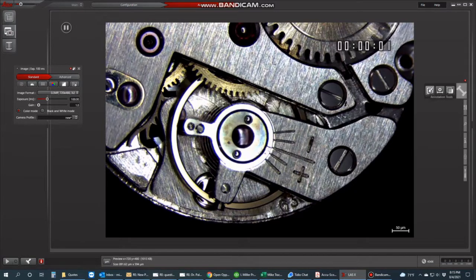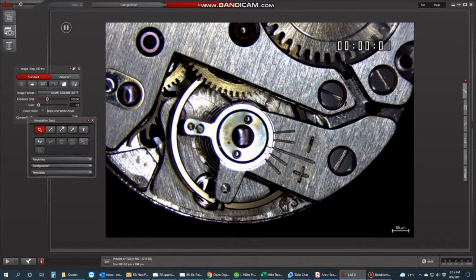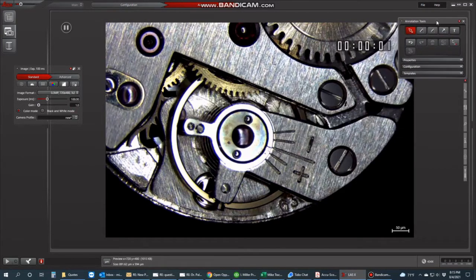We then want to come here to our annotation tool window, and again we can position this anywhere we want. Here's fine, and we can create a text box. I understand that you like to put a text box in here, and you maybe like to put left, right, and scope characteristics. So we can actually save this here as a template. You're all familiar with templating. So how do we do that?